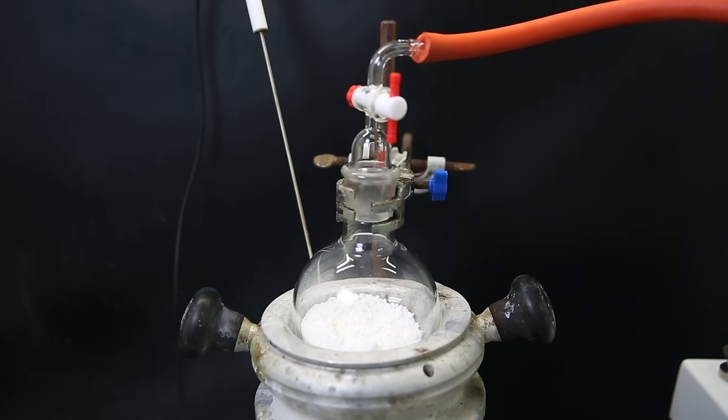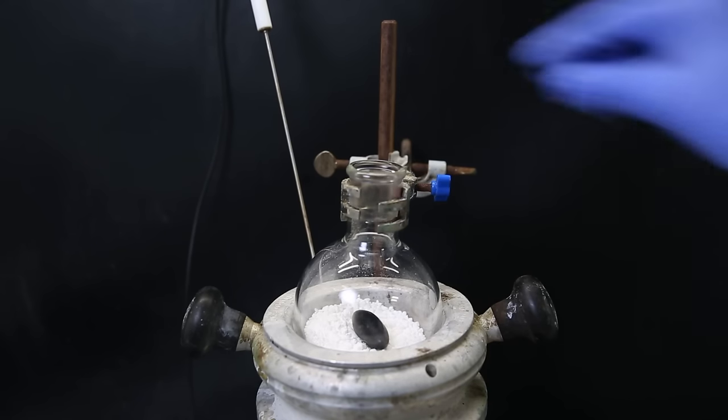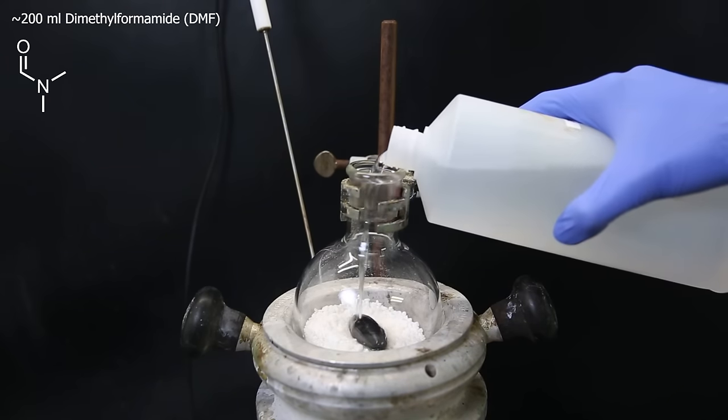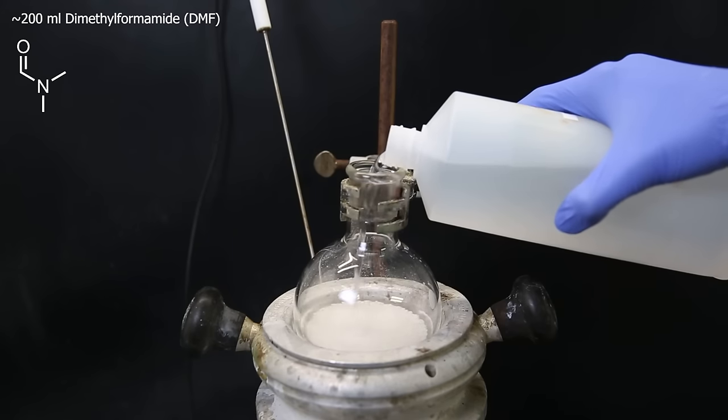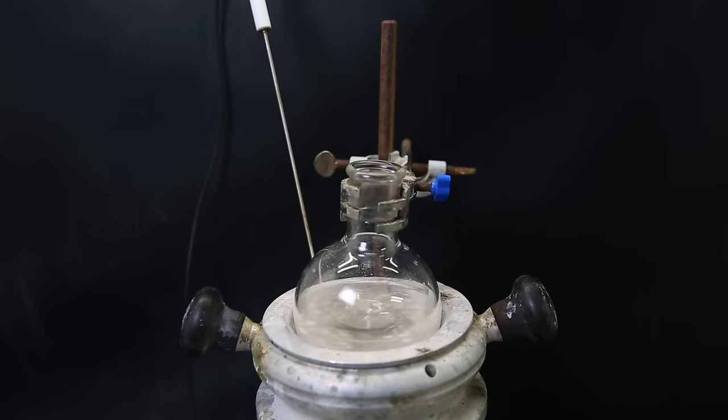I heat the flask and pull a strong vacuum to make sure all traces of DCM are gone, because having a bunch of DCM present can cause an explosion in the next reaction. When that is done, I can start the next reaction. So I add a stir bar, and then approximately 200ml of dimethyl formamide as a solvent. I also started heating it to 80°C, and waited until everything dissolved.